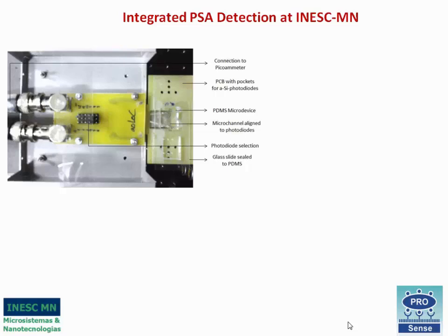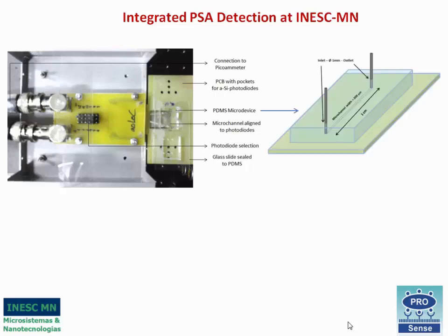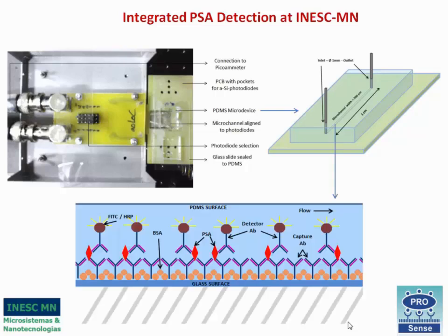Such integrated biosensing methodologies become advantageous when increasing the assay sensitivity with time, as well as for reproducibility measurements, both for signal acquisition and for analysis. Here I showed the simple microchannel of the dimensions that we are going to use, upon which the microfluidic ELISA that I have already pointed out is performed.